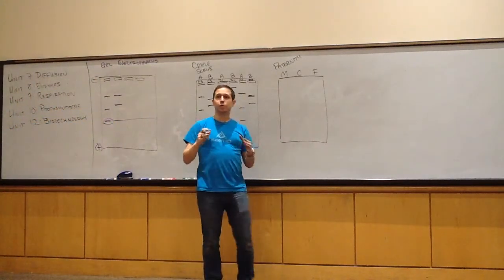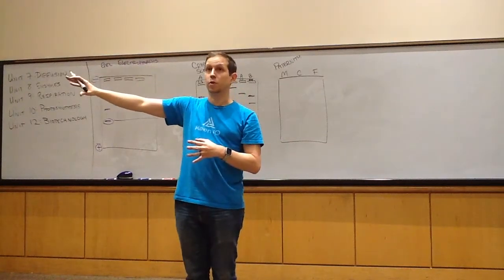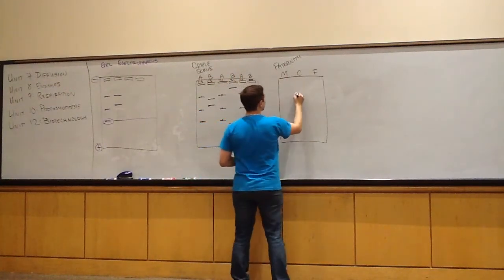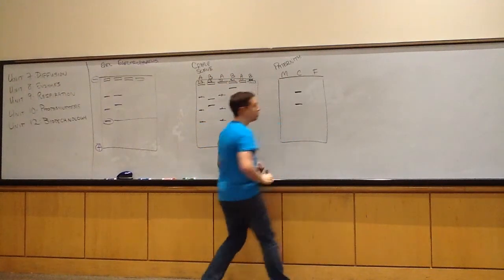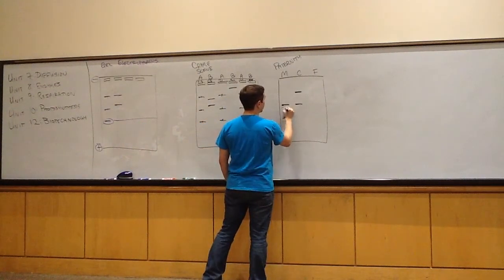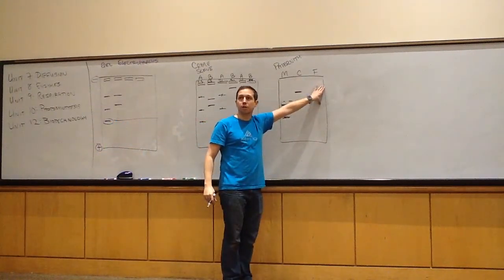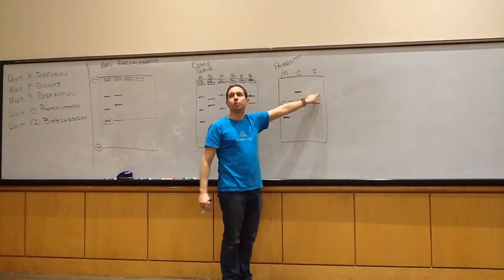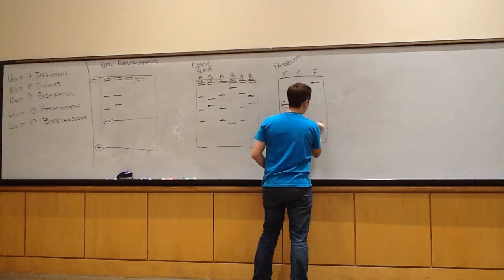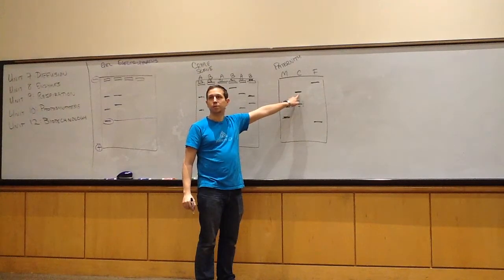So remember, the way that this works is the child is going to get 50% of his or her DNA from his mother, and 50% from the father. So that means that if the child only has 2 bands, that child shares one of those bands with his or her mother. And that means that for this person to be the father, they have to share that other band with the child. So if this person instead has something that looks like this, he is not the father, because he doesn't share this band with the child.